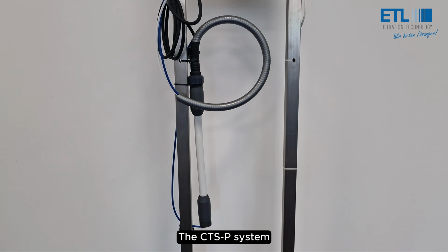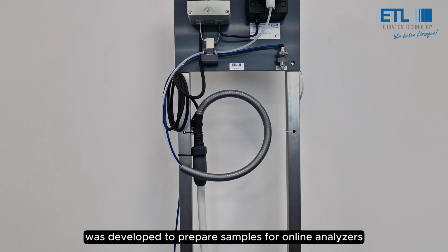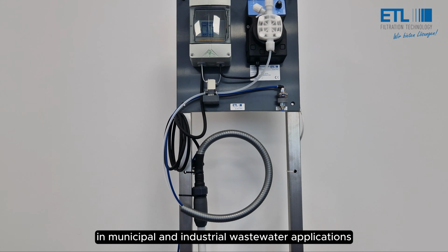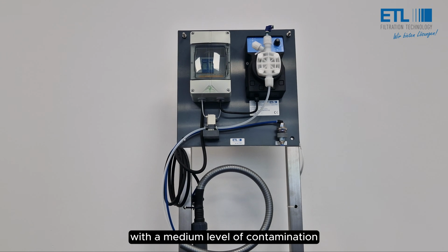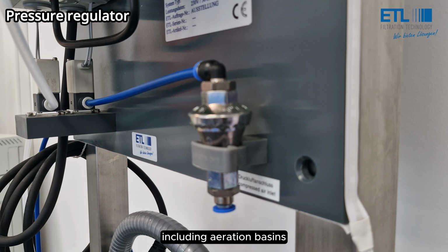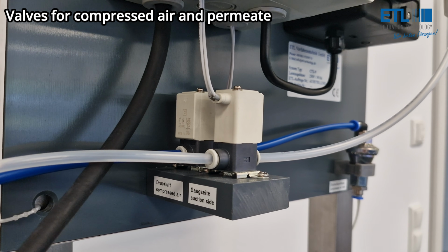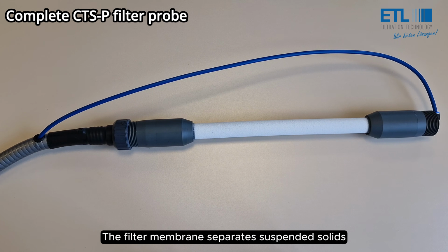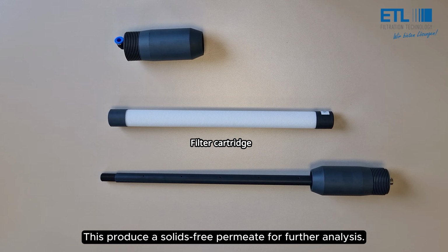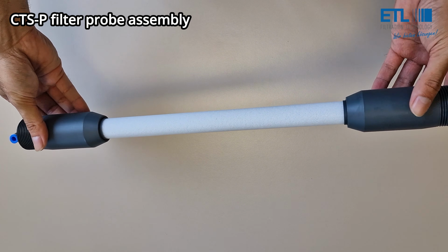The CTS-P system was developed to prepare samples for online analyzers in municipal and industrial wastewater applications with a medium level of contamination, including aeration basins, treatment plant outlets, tanks, and channels. The filter membrane separates suspended solids from the sample. This produces a solids-free permeate for further analysis.